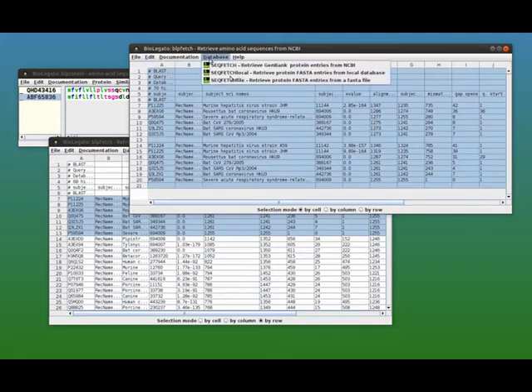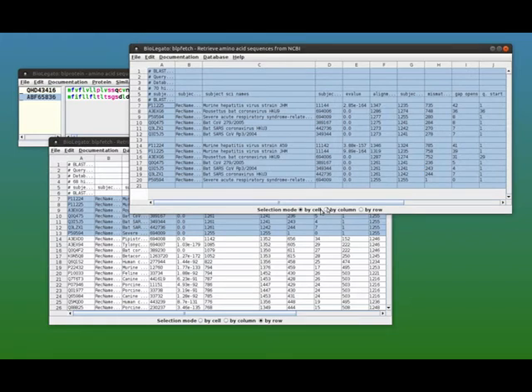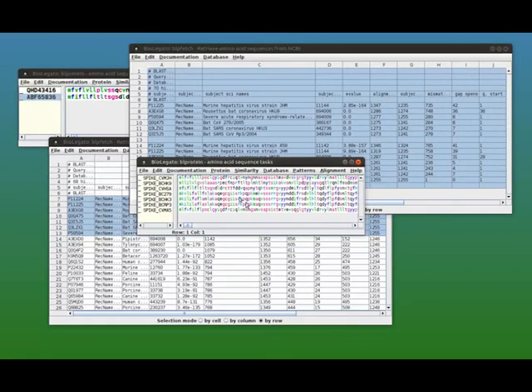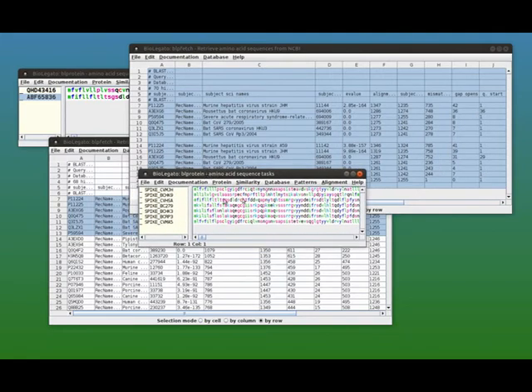We select all, we open seqfetch and retrieve those sequences from NCBI, and now with ad hoc pipelining, of course, they go to a new BLP or BL protein window.